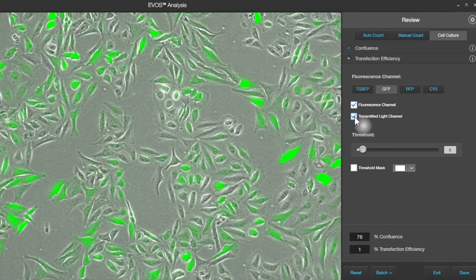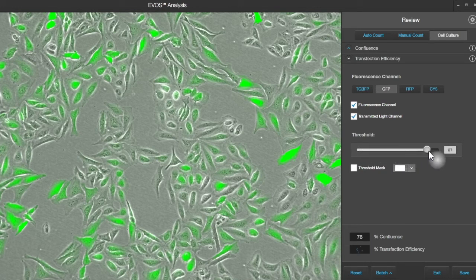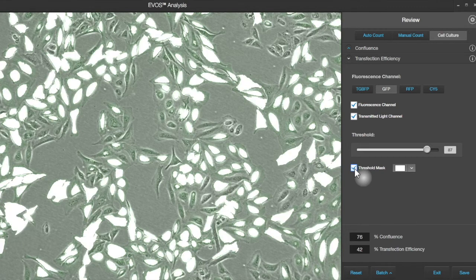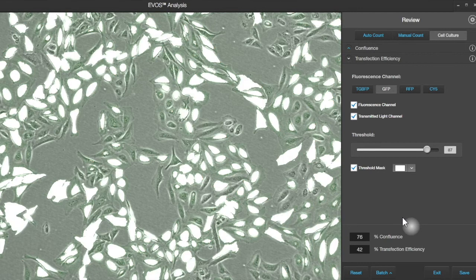What we're going to want to do is adjust this so that we are selecting all of our positive cells. There's a threshold slider here, and this is our transfection efficiency. We need to slide it to the point where we're getting the correct amount of transfection efficiency for this image — that's something determined by the end user. Right now this is 32%, so it's only picking the highest expression levels. I'm more comfortable with something in the 42% range for this image, so we're going to use this setting. We can turn on the threshold mask, which shows us the pixels that have been selected as positive. It's possible to switch this to a different color — I'm going to leave it in white mode.